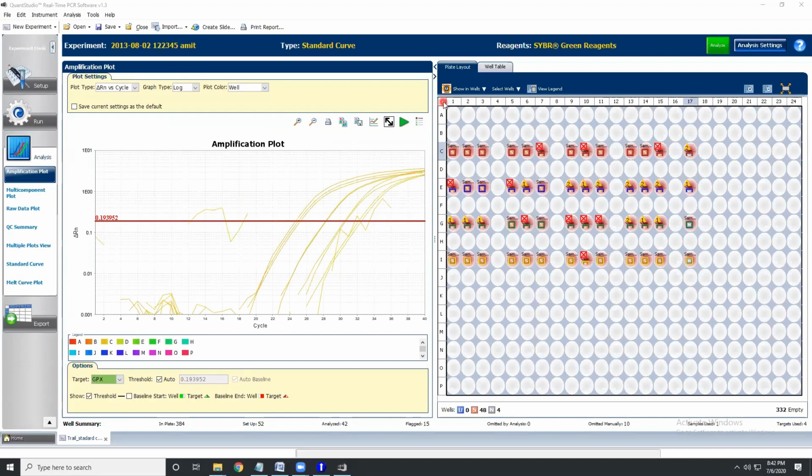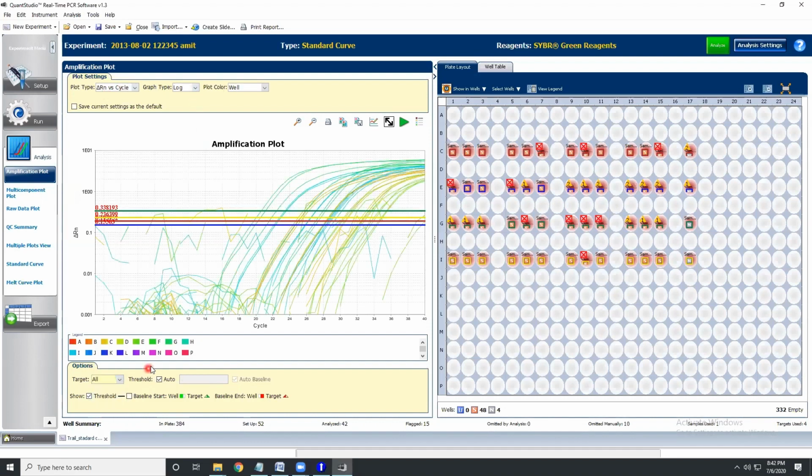So you select in the corner of the plate. So in this place where the red cursor, you might be seeing where I am clicking, right? And then you do the analyze. What it does is that it gives you the amplification plot, right? You can select for all, and then you will see a lot of background noises, and then you can see the amplifications. So this is how your amplification curve looks like.